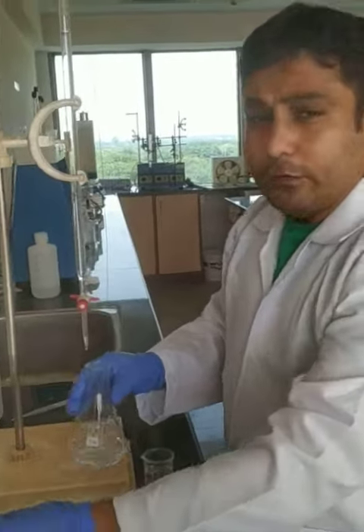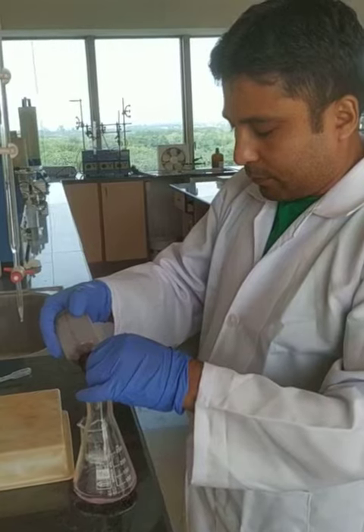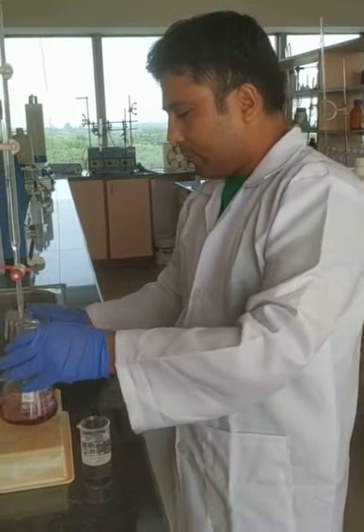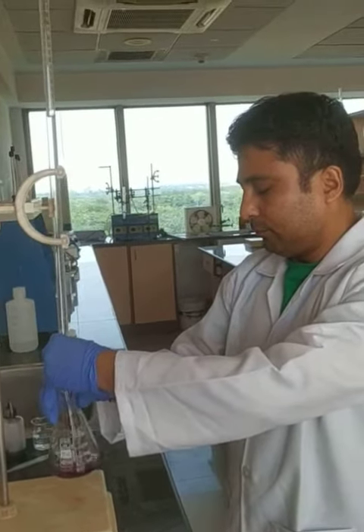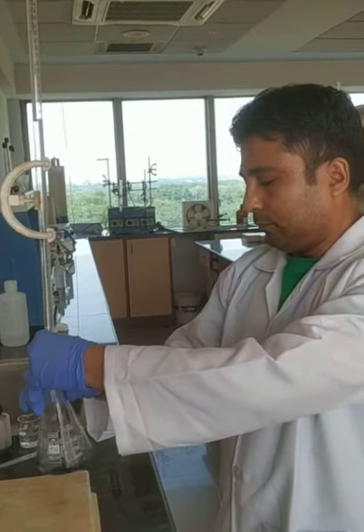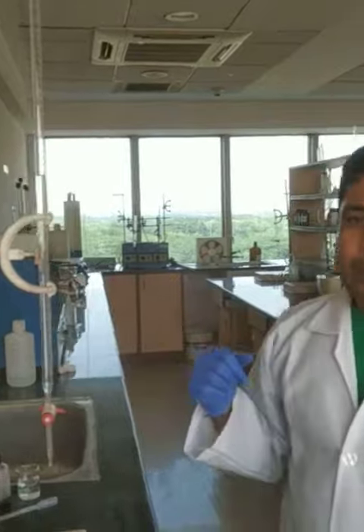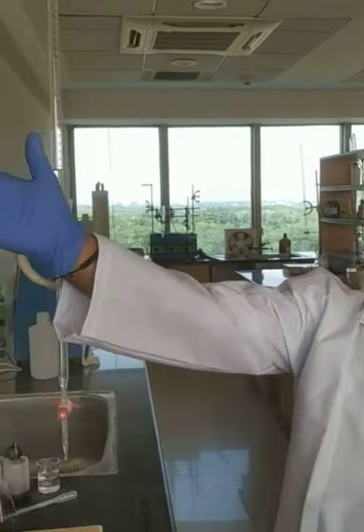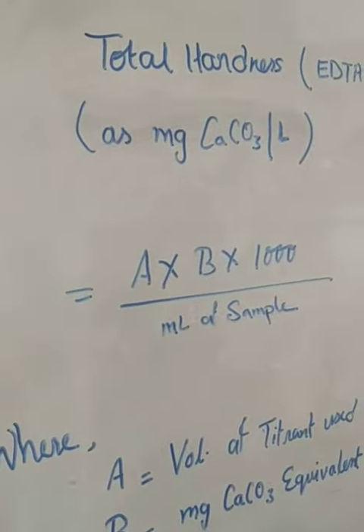Add 8 to 10 drops of Eriochrome Black T indicator. Then titrate the sample with 0.01 molar EDTA until the color changes from wine red to blue. Once it turns blue, note down the burette reading and use the final volume of titrant in the given formula to calculate total hardness as mg CaCO₃ per litre.